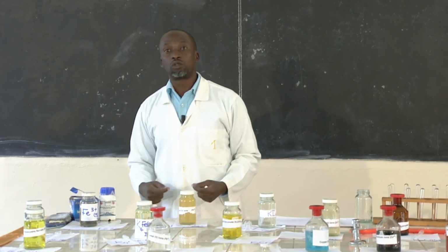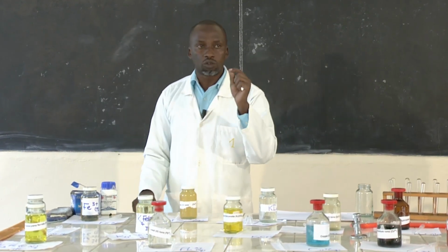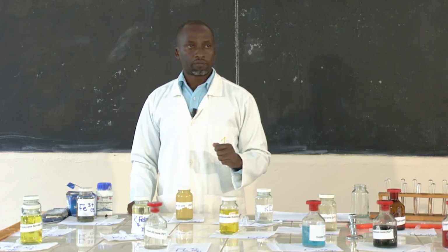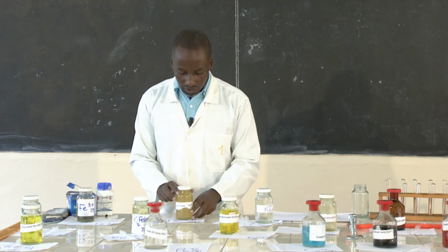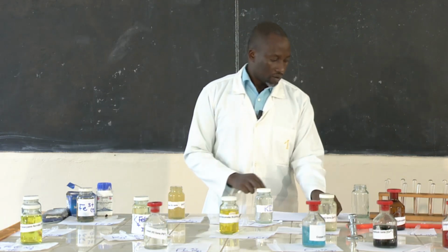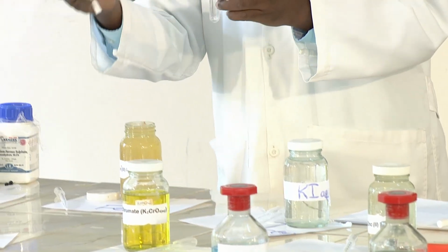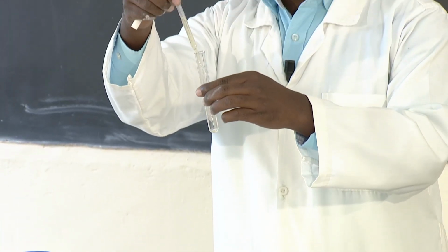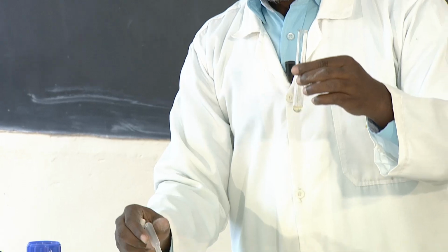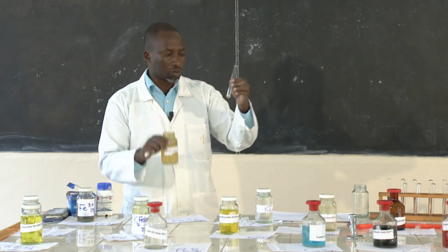So we are just going to start right away, and I ask you to pay attention and see what is going to happen. We are starting with this iron 2. You don't need to use a lot of solution when you are carrying out these experiments. This is a solution of iron 2.